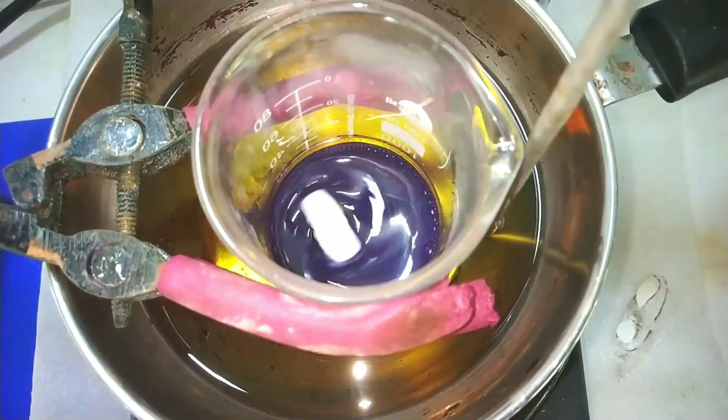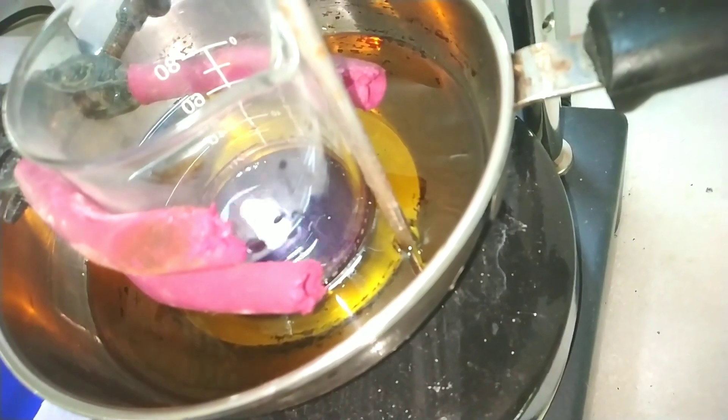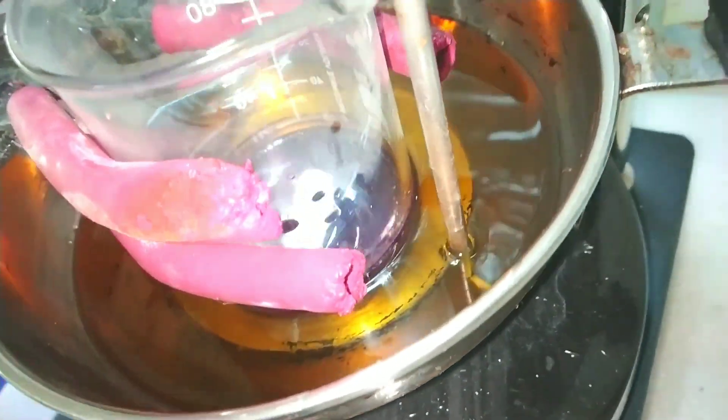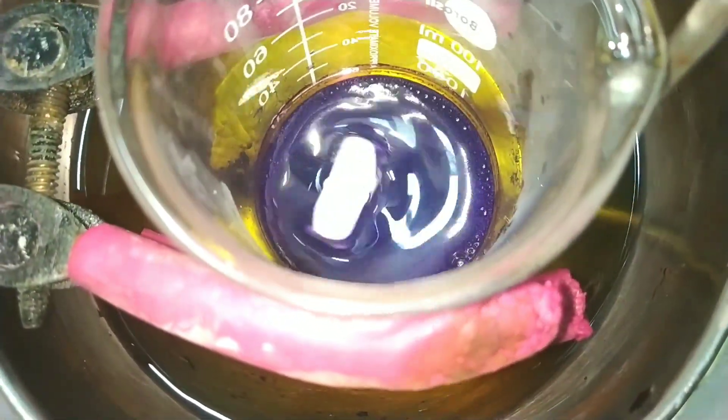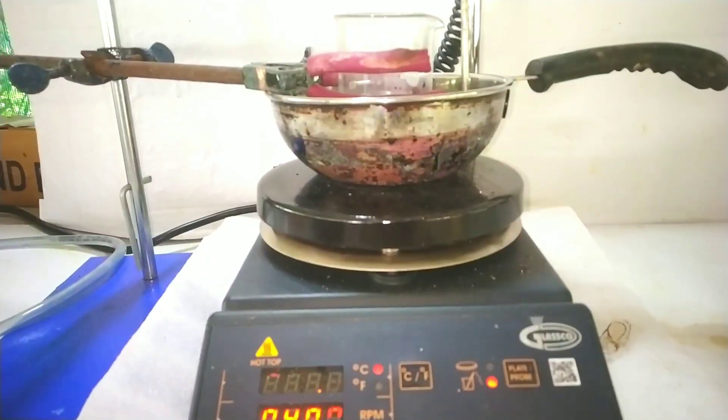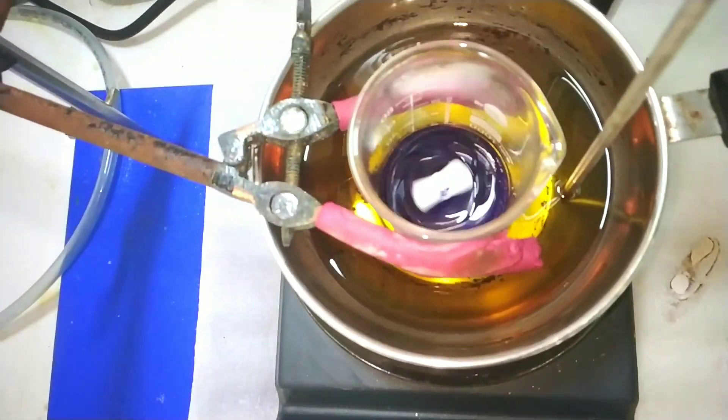After about one hour, you can already see a purple color starting to develop in the beaker. I'm not sure of the exact equation of what is happening here. Anyway, the ammonium dihydrogen orthophosphate reacts with orthophosphoric acid and manganese dioxide at temperatures of around 230 degrees Celsius to form this compound.